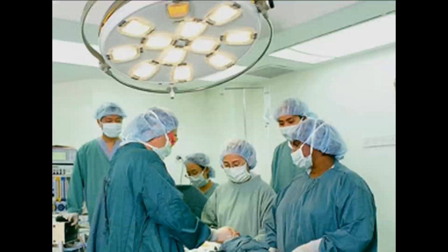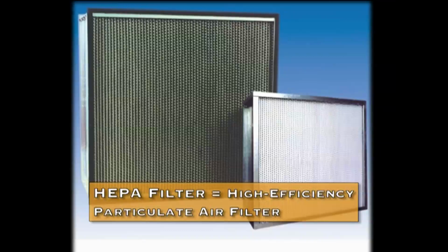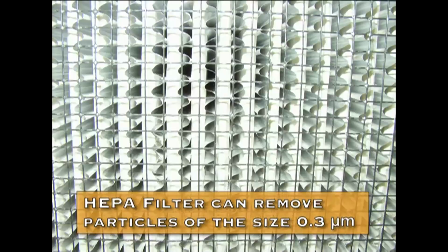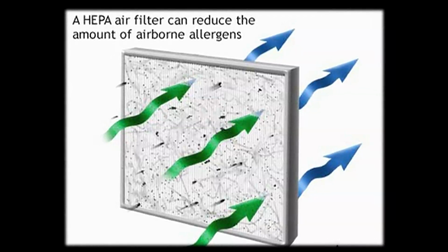It is also used in operation theatres, and the most effective one is called the HEPA filter, which stands for high efficiency particulate air. These filters are capable of obstructing materials of the size of 0.3 micrometers, and their efficiency is so high that almost 99.9% of compounds are restricted with these filters, right?